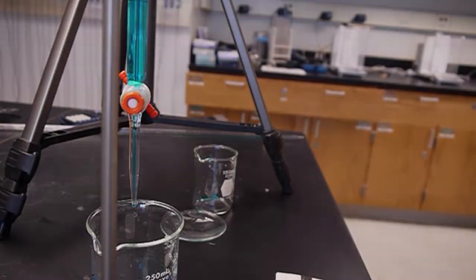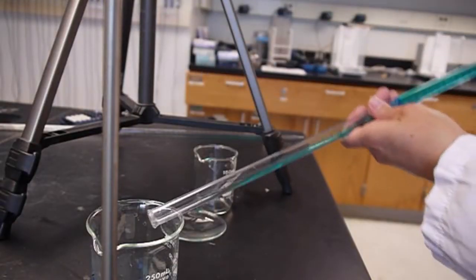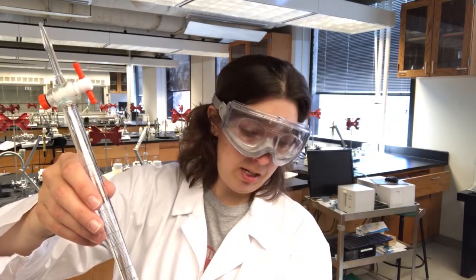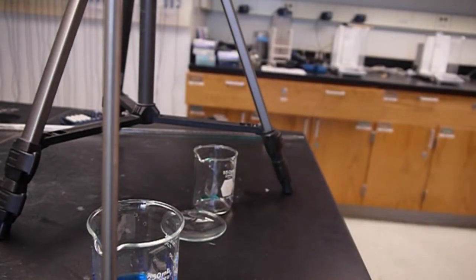Okay? Let's say we're at the end of our titration and we want to clean out our burette. So at the end of the day, you are going to want to rinse with water. All right, so you can empty out your burette. I'm going to just take mine out of the stand, empty it out, open up the stopcock so that all of that solution drains from the tip. That's a nice fast way of doing that. You could also just open the stopcock over a waste beaker and let it drain that way.